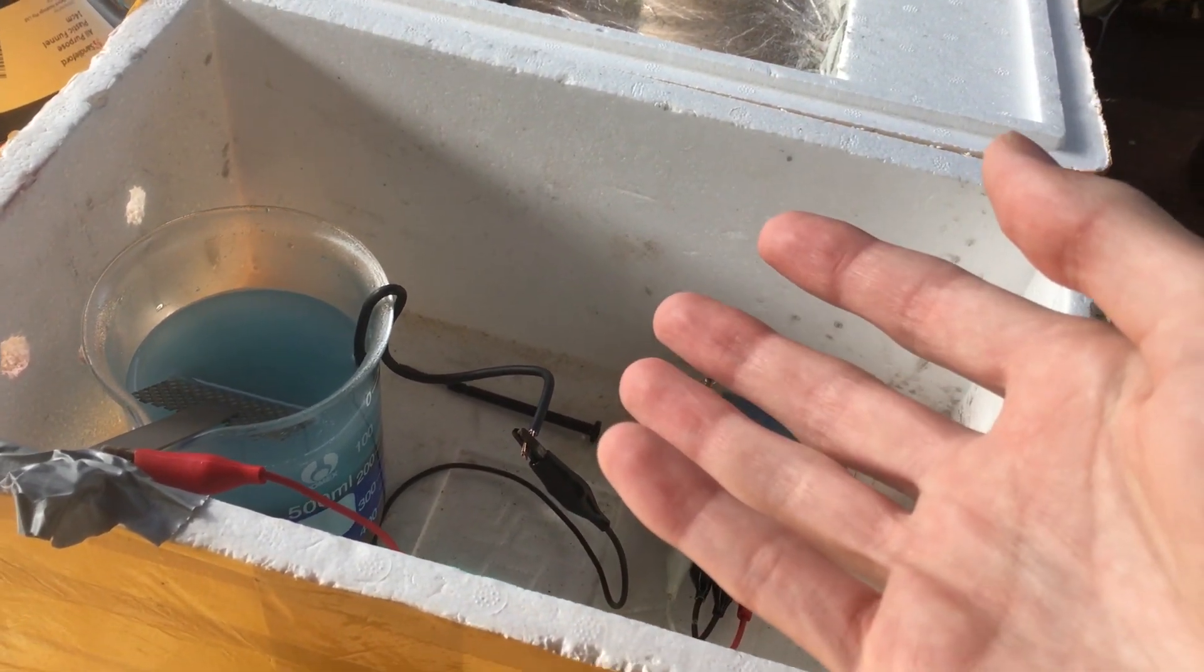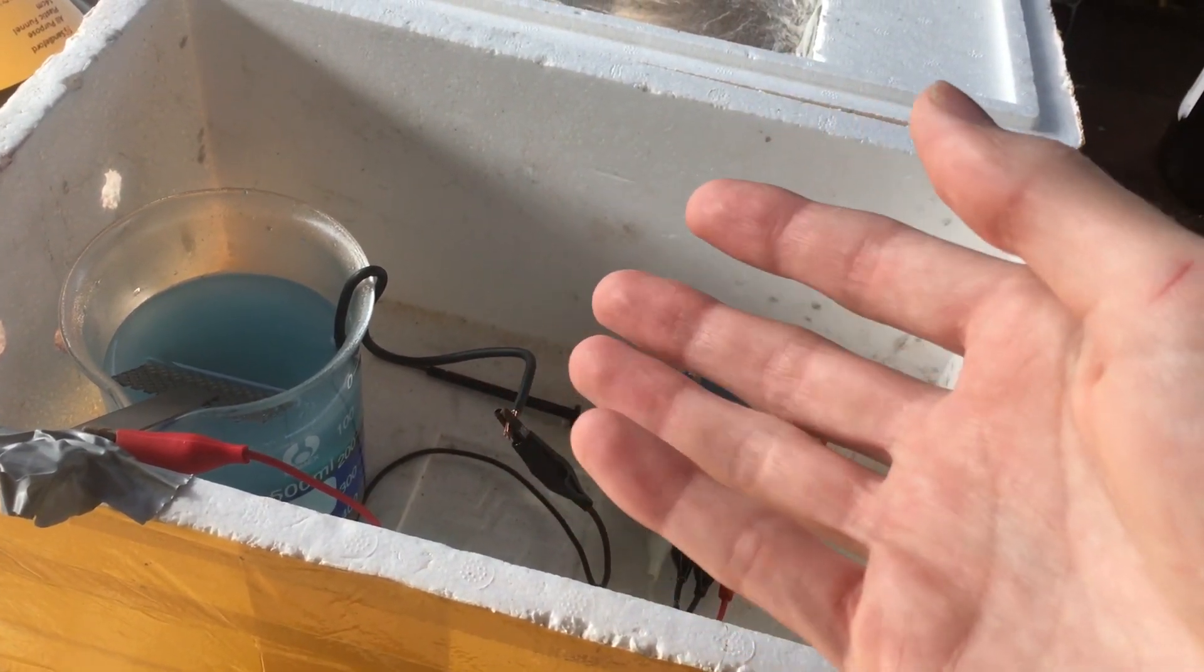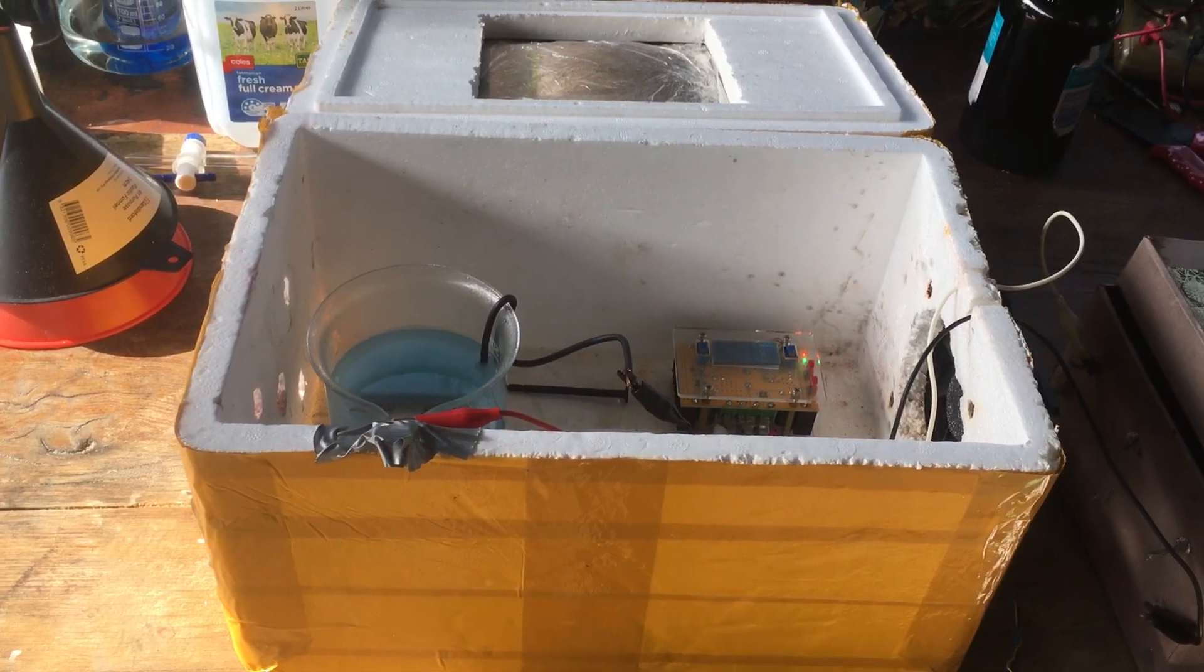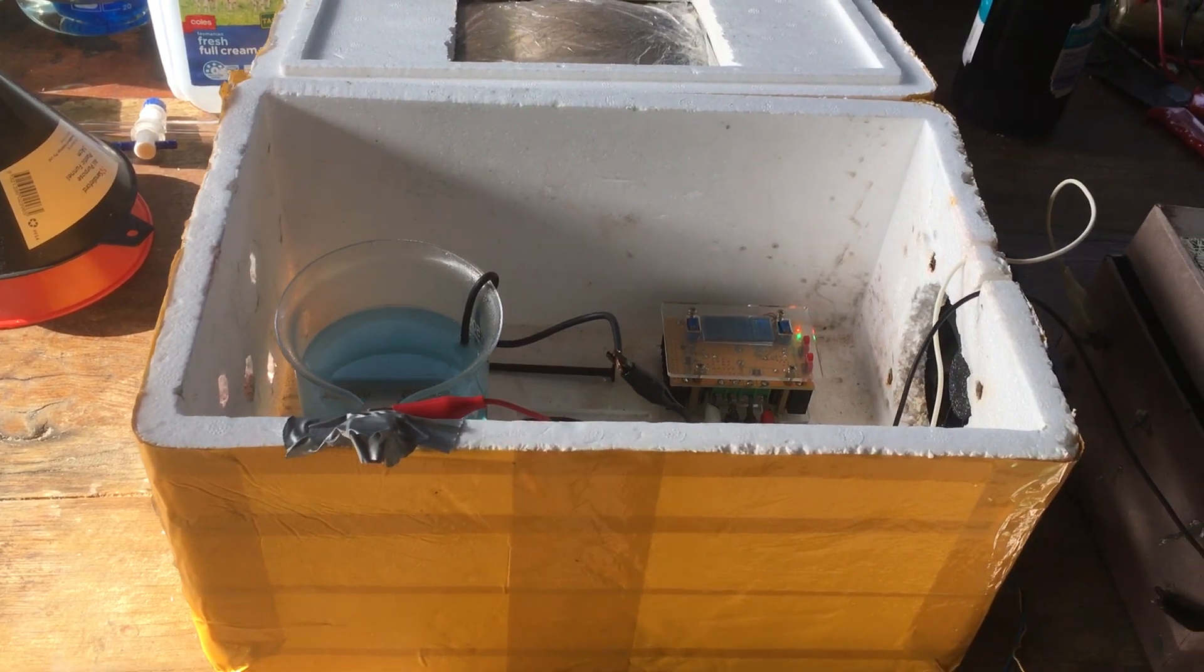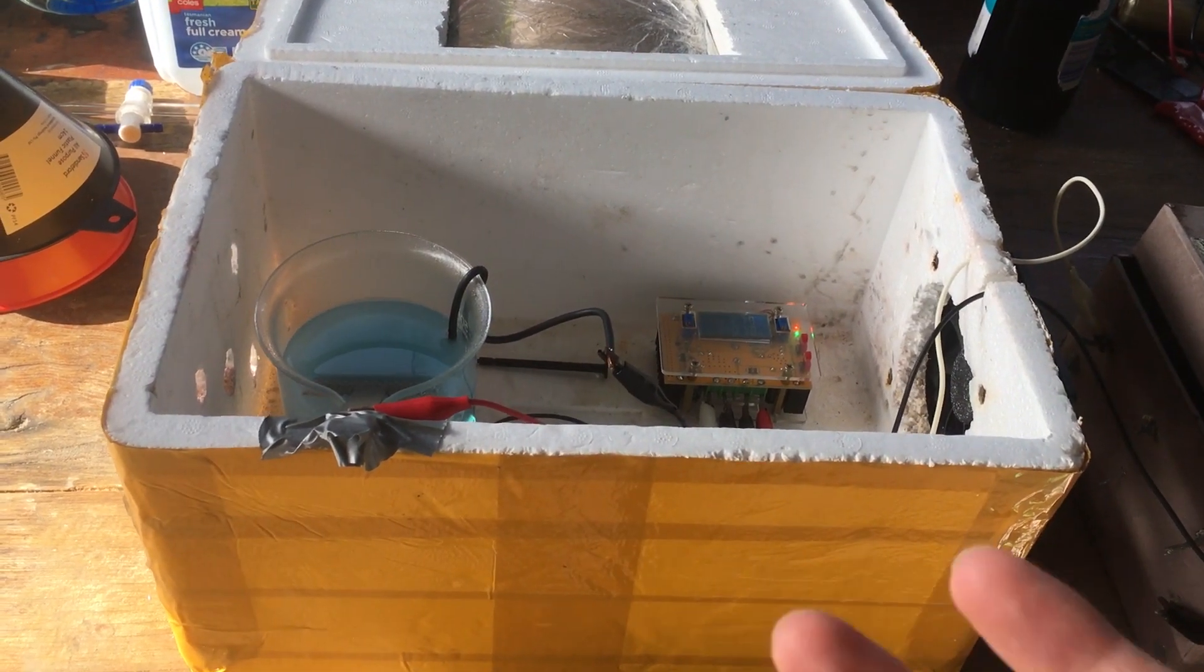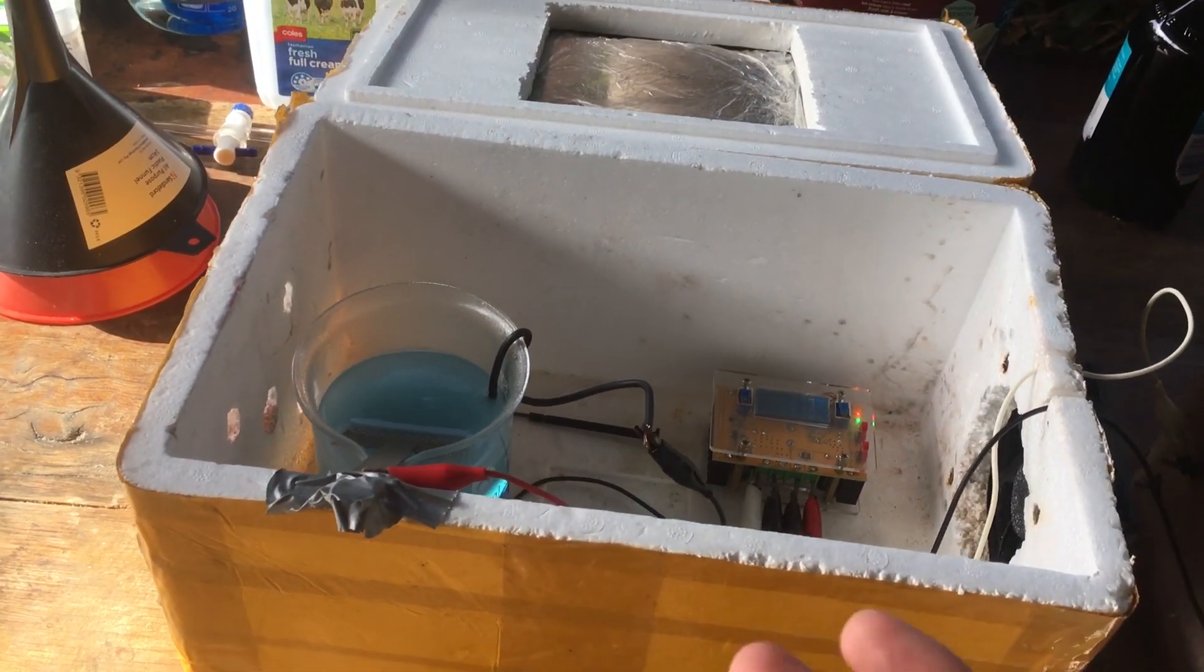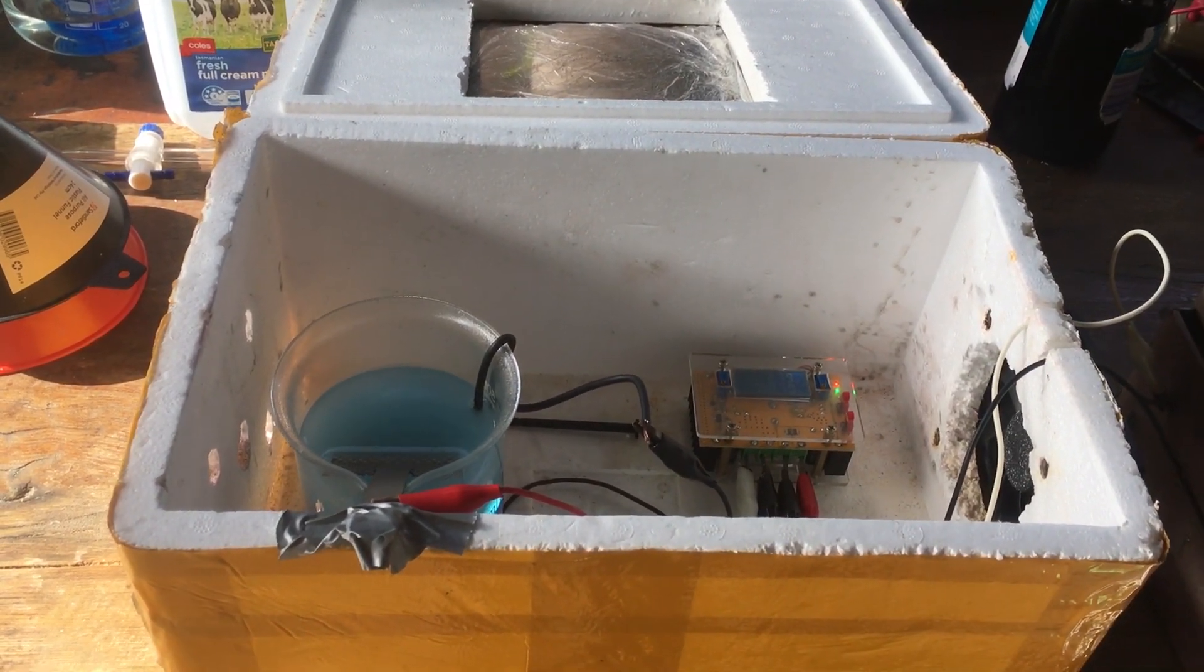And then, based on the amount of charge that we'd put through the cell, we'd be able to work out the efficiency. Basically, with a coulometer, we'll be able to work with some real numbers rather than just guesswork. And in that case, we'll be doing actual science.